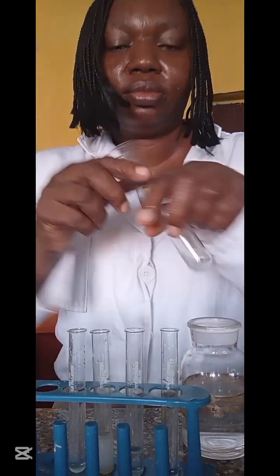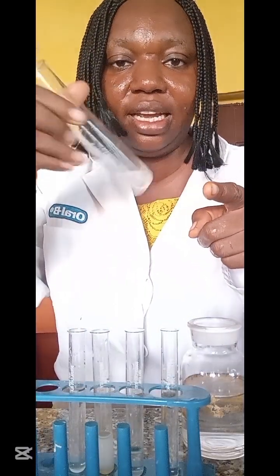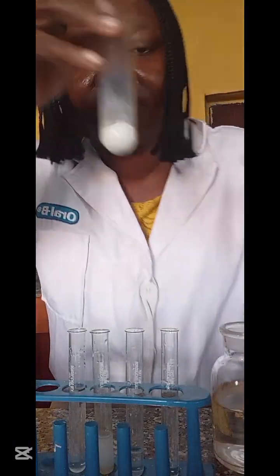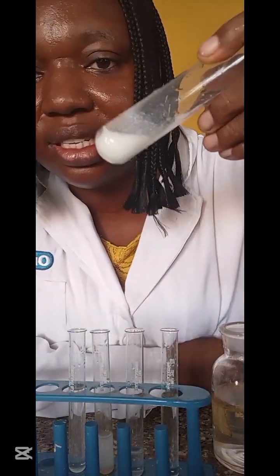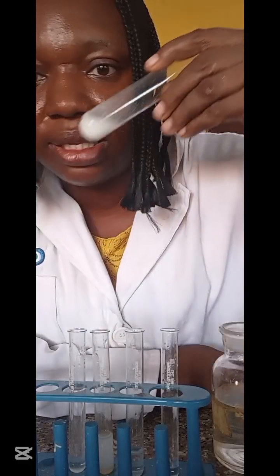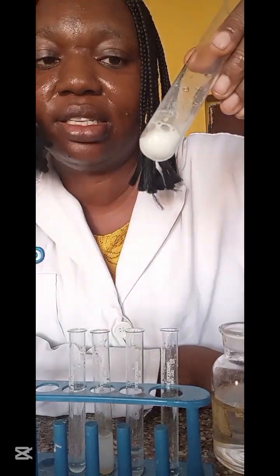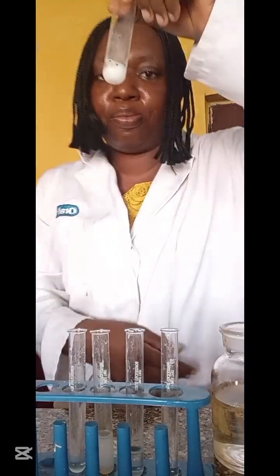Now let's go to the powdery ones. This is a lead solution. Very different. Can you see? This one is white. It's different from that one that was jelly-like. Look at it. Powdery.